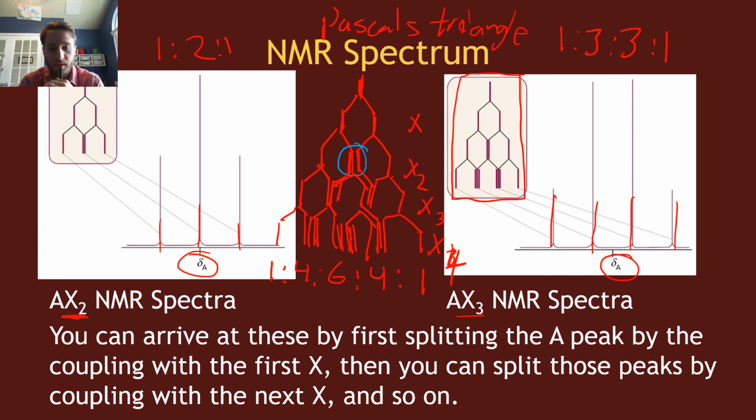We talked again about chemical shifts and how they appear in your spectra, and then when nuclei couple together, how that impacts where those peaks are for those shifts, and the type of information we can potentially learn from studying chemical shifts in an NMR spectrum.